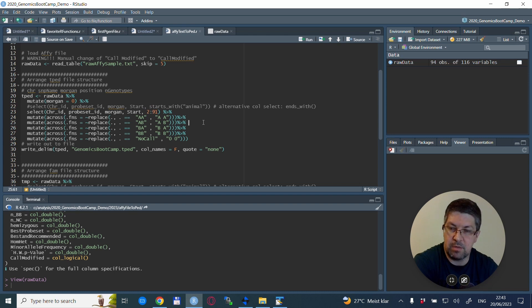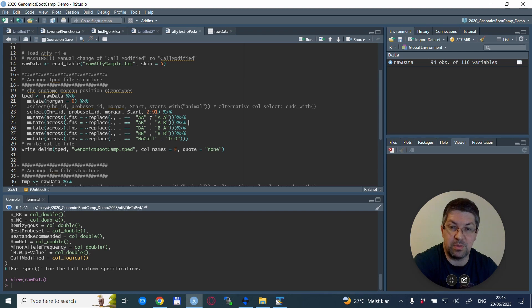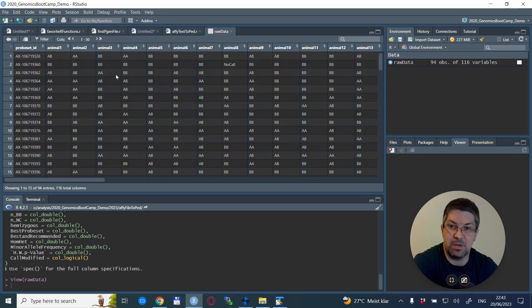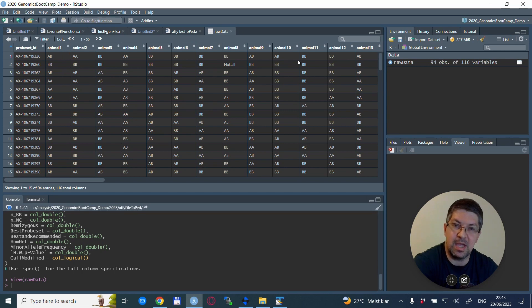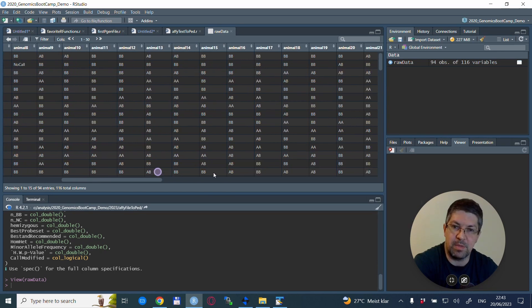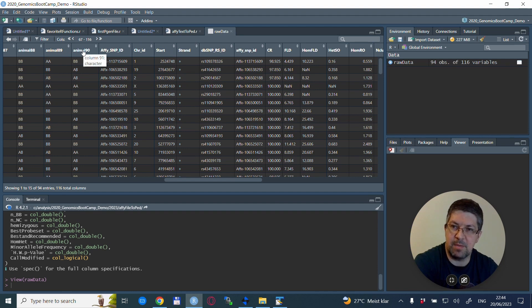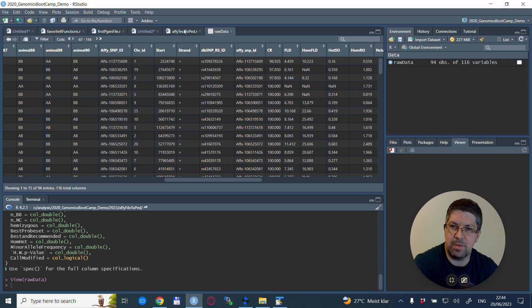So that is the first thing that we do. Now, you might remember in the raw file—and actually, you don't need to remember that, because we have also in here—all the alleles are together like this without space. This is not good because they are just occupying one column right now, and we need them to occupy two columns.